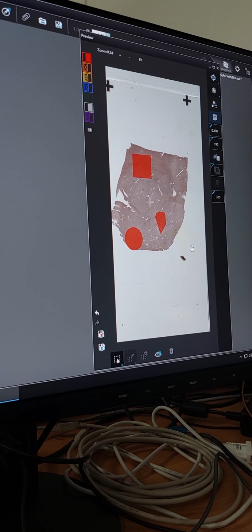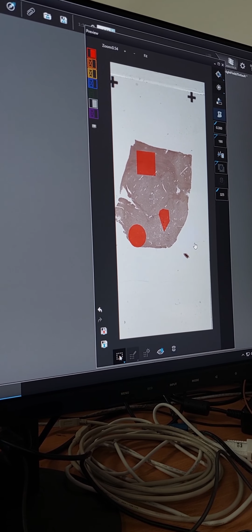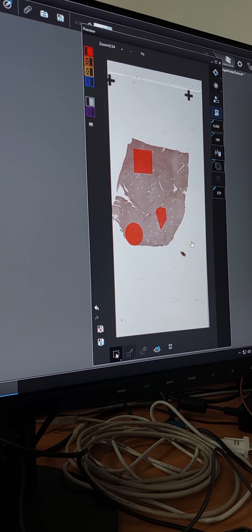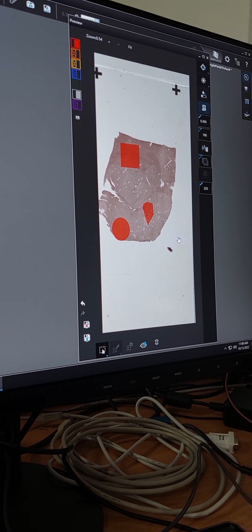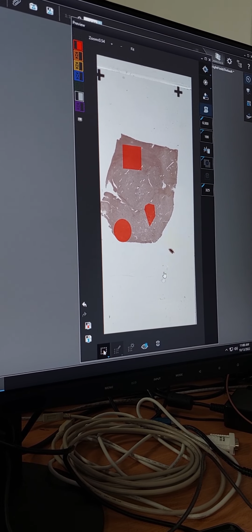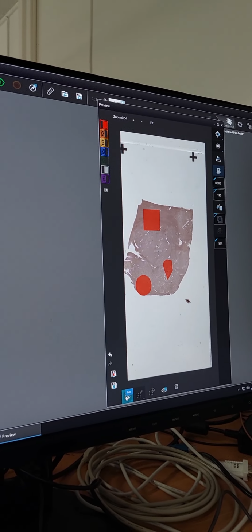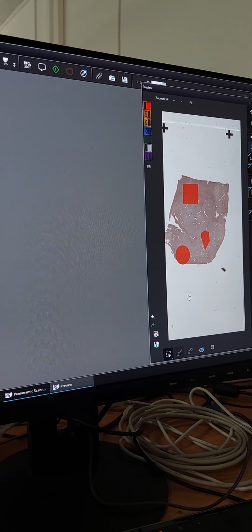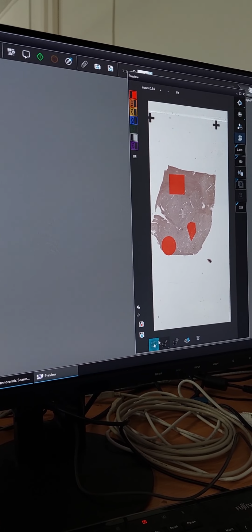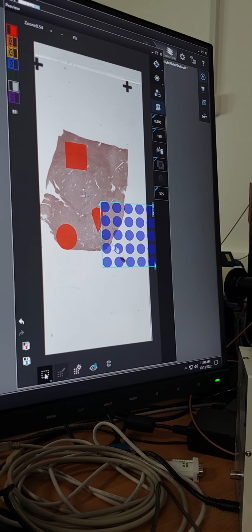The time is too short now for me to show you everything, but as you have a basic knowledge of the scanner, I recommend just clicking everywhere and you will find what you want, because everything is marked. Perfect. After a few scannings you will know what to do, and you can always contact support. Okay? Yeah.